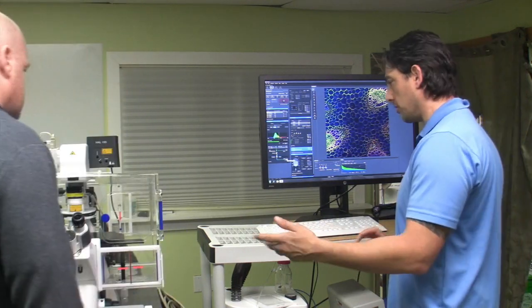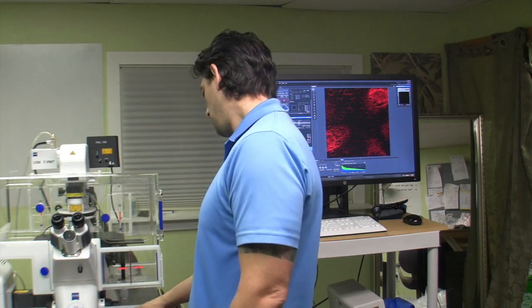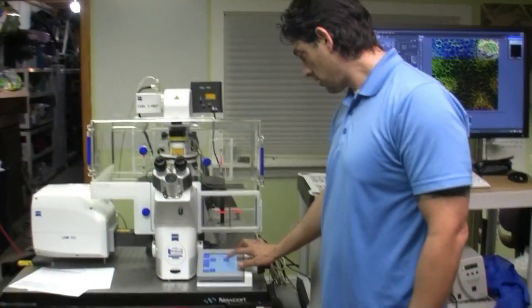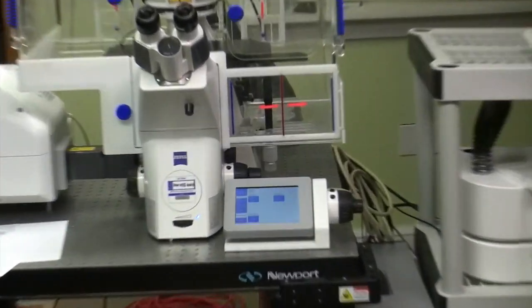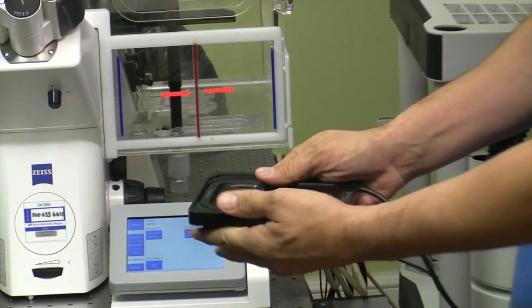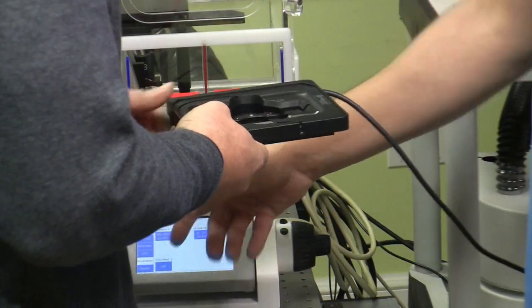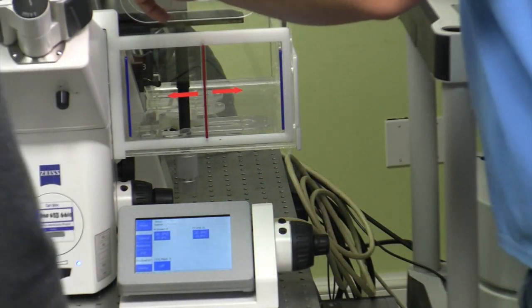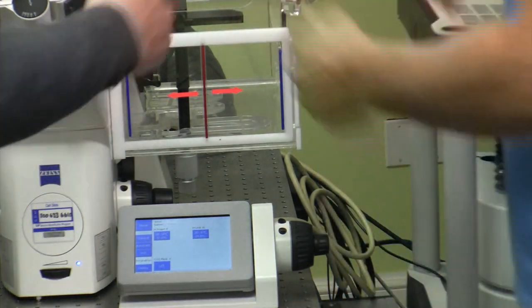Right now, while we're doing this, I have the heat blasting away. I don't know if you want to zoom in on this. I don't know if you can see this, but this insert right here is one of the heated inserts. All you can do is feel it. It's warm to the touch. This is on its way up. It's at 37. It's at 36.9. And then inside the XL heating unit is blowing heat inside, and you can stick your hand in there and feel it.